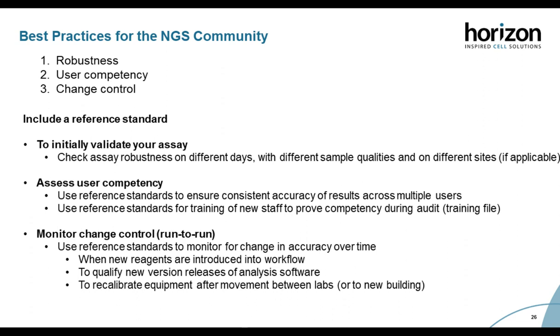Finally, labs are often subject to changes in location, where equipment needs to be moved between labs or even to new buildings. And the recalibration step to make sure the equipment is performing as it was before is essential. And running reference standards before and after the move can help to confirm this.